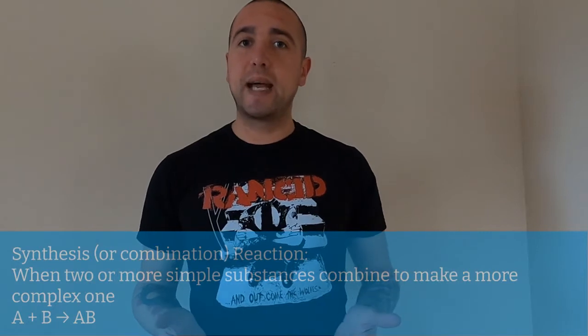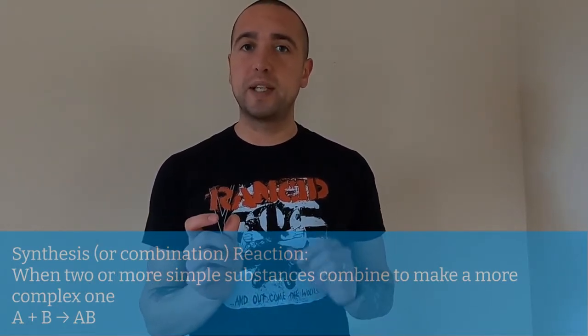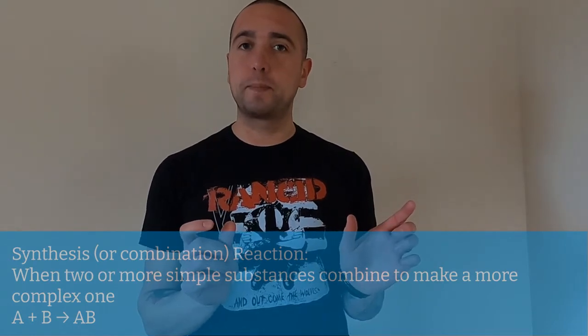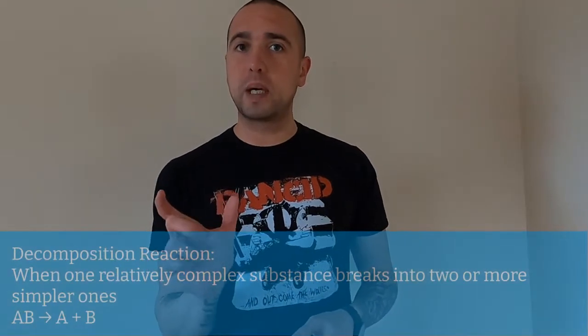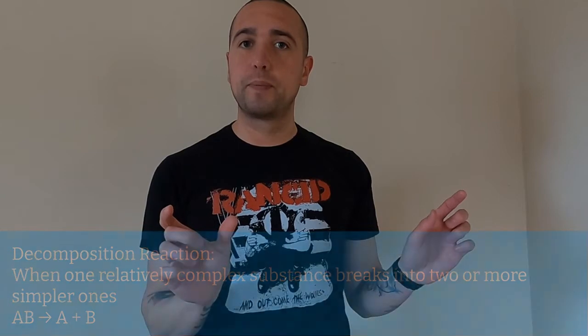So through this you're going to be looking at 5 different types of reactions. Now there are more than 5 types of reactions and some of the types might overlap, but these 5 do not, and they're the most basic types. The first type you'll be looking at is called a synthesis reaction, and that's where 2 simpler substances combine to make one more complicated one. The next is called a decomposition, where one more complicated substance breaks apart into 2 or more simpler ones.